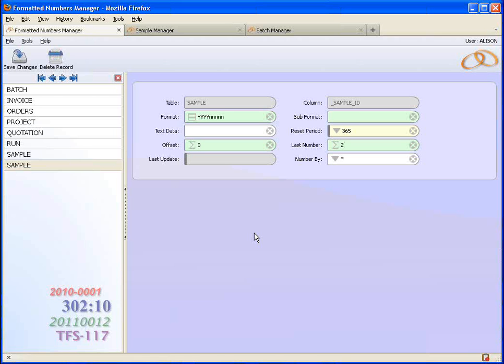Okay, so I think this is all actually explained reasonably well in the administrator manual as well, the same information. And obviously this class is going to be stuck up on YouTube, so you can review it again later. And I will answer any question that anyone's got in a moment.